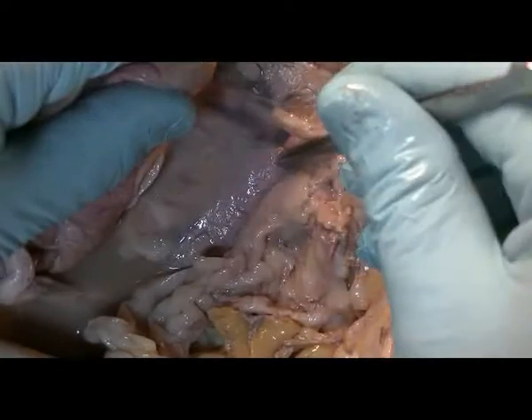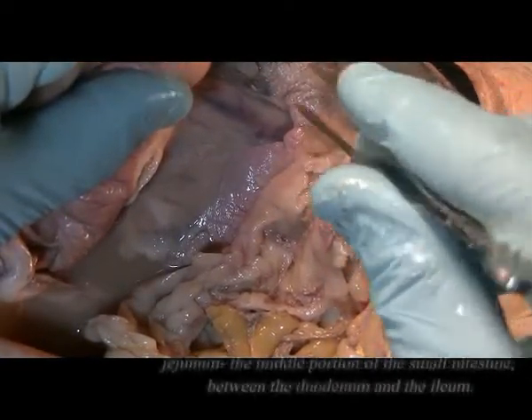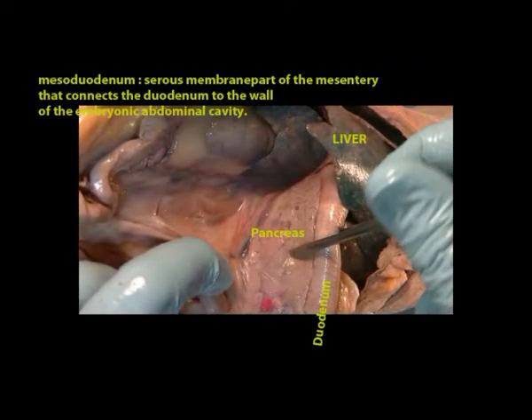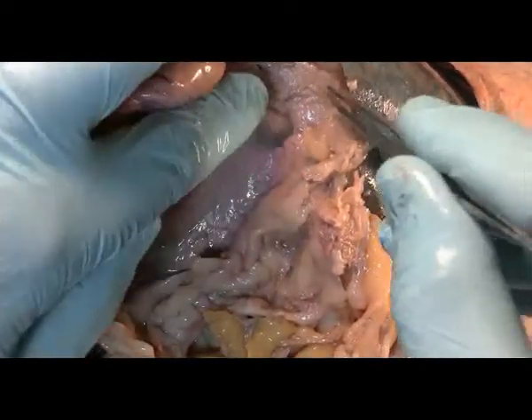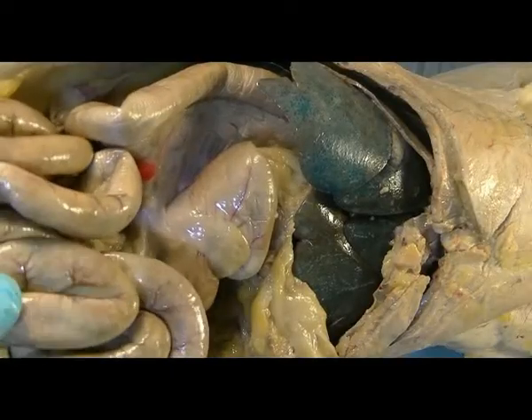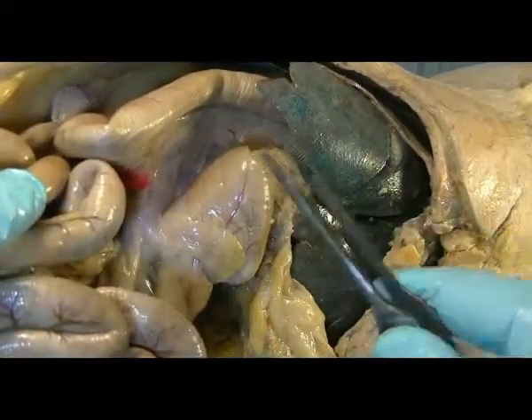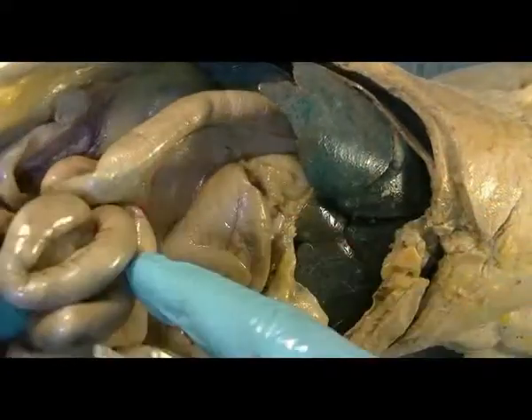And at the base of the duodenum, you can see the pancreas, which is here. It's easily confused if you don't pay attention to the texture. The duodenum is kind of smooth and glossy, while the pancreas has a bread type texture.